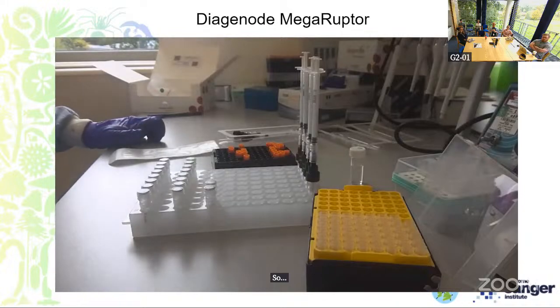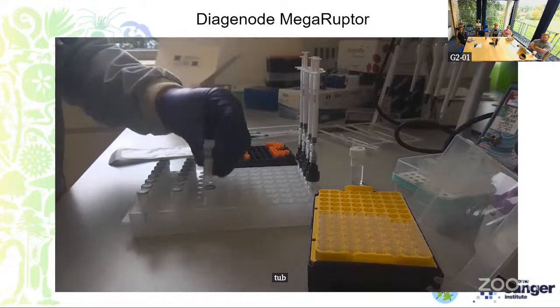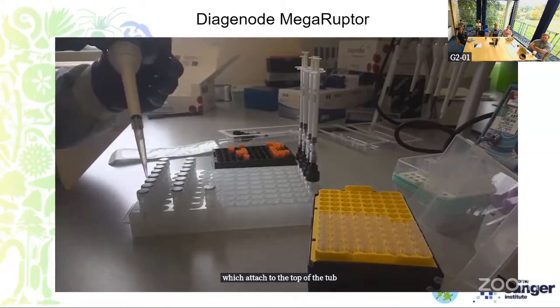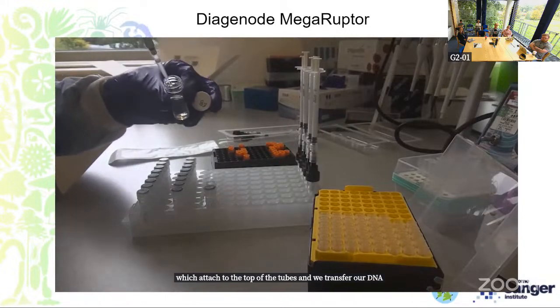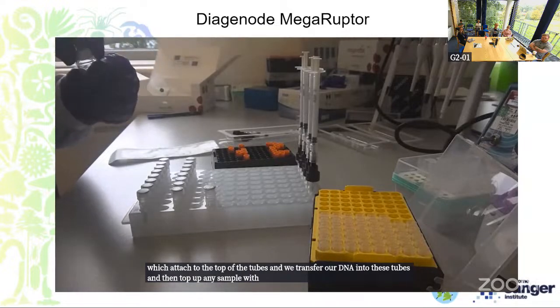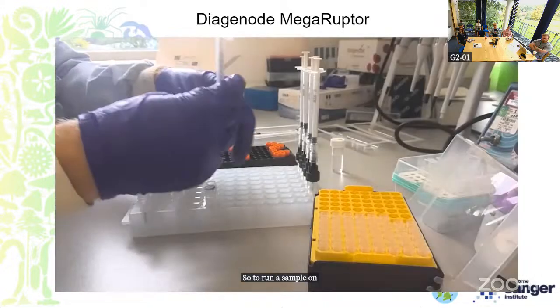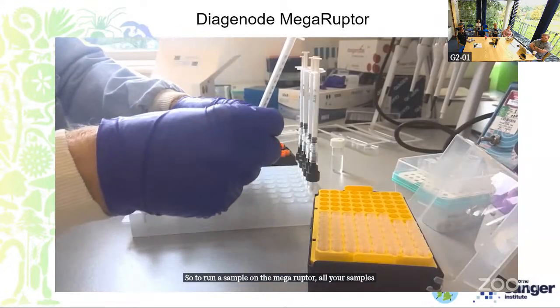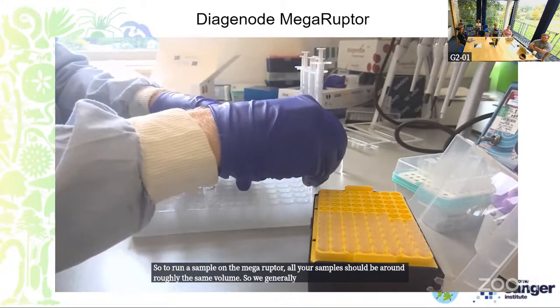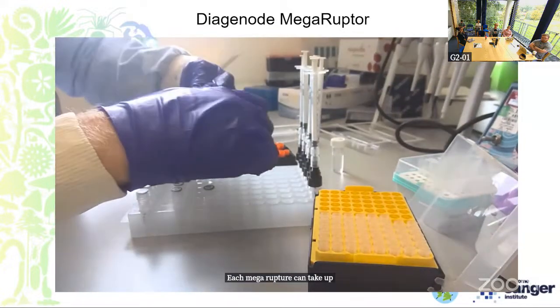For the Megaruptor, we have these screw cap tubes and syringes, which attach to the top of the tubes, and we transfer our DNA into these tubes, and then top up any sample with EB buffer. So to run a sample on the Megaruptor, all your samples should be around roughly the same volume. So we generally aim for 150 microliters. Each Megaruptor can take up to 8 samples at a time.